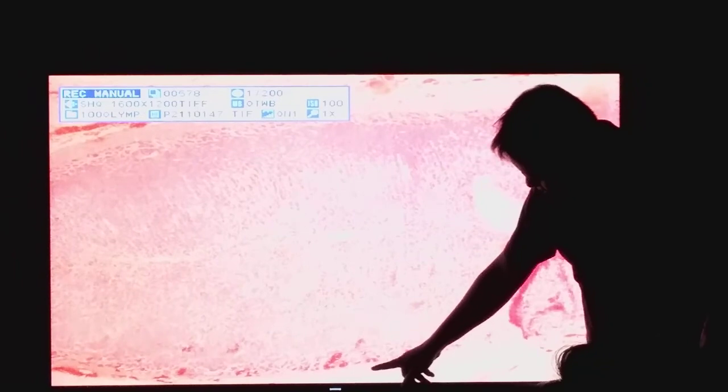Immediately underneath the capsule is the zona glomerulosa. That should be the zona glomerulosa area. Immediately near the medulla is the zona reticularis, and then the thickest portion, where you will be able to see cells arranged in trabeculae or columns, is the zona fasciculata. Let us zoom into the general appearance of each layer.